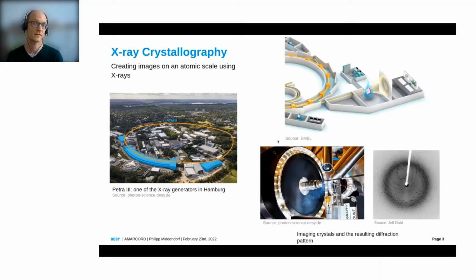Now you might think that, well, if you want to take images of proteins, why don't you shoot the proteins themselves? Well, you can do that, but unfortunately, we're not there yet. You can produce images with that, but these images aren't good enough to really be used to analyze the proteins. So instead, you take the protein and you grow a crystal from it, sort of like when you have salt water and you evaporate it, you get salt crystals. You might be able to get protein crystals.